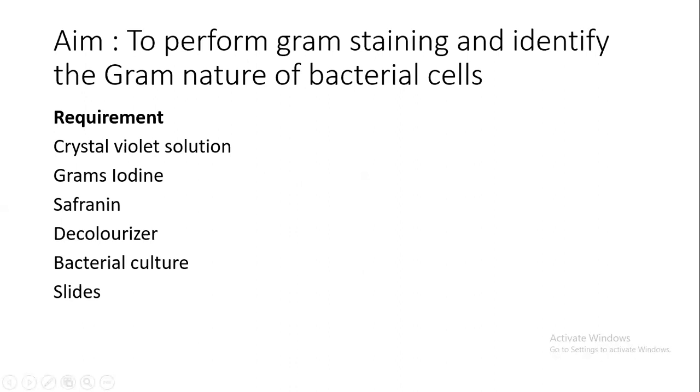Hello students. So we are going to learn about gram staining technique today. So the aim of our experiment is to perform gram staining and identify gram nature of bacterial cells.